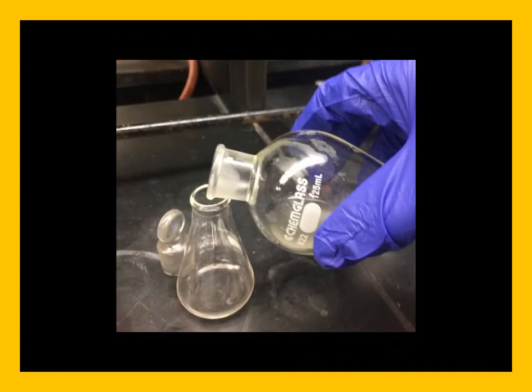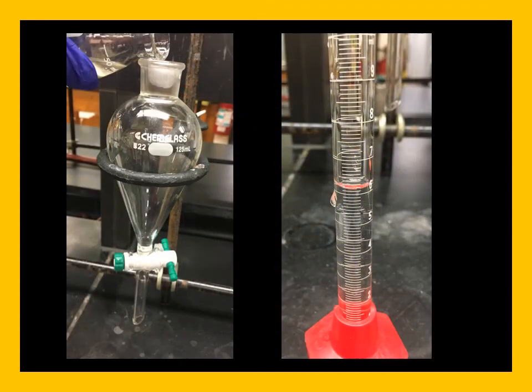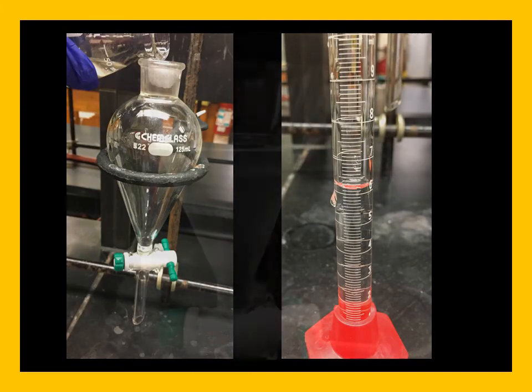Now we want to wash our layer, and instead of draining the aqueous layer out the bottom, we need to pour it out the top. So we've drained the dichloromethane. We are now pouring the aqueous layer out the top. We're now returning the organic layer to the separatory funnel and measuring out 6.1 mils of water. This is just DI water that we're going to once again wash the organic layer with.